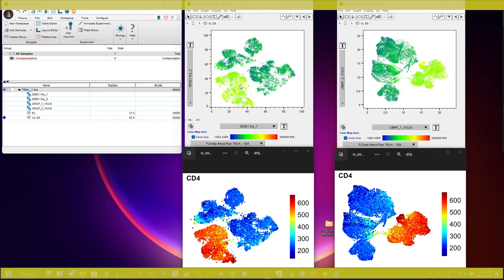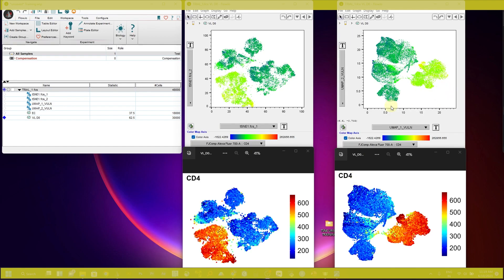You can also see the difference between FlowJo-generated and R-script-generated t-SNE plots in the expression of CD4. This looks much better than the FlowJo-generated t-SNE and UMAP plots. Today I'm going to show you how you can transform your t-SNE plot, UMAP plot, as well as TriMap plot using the R script.